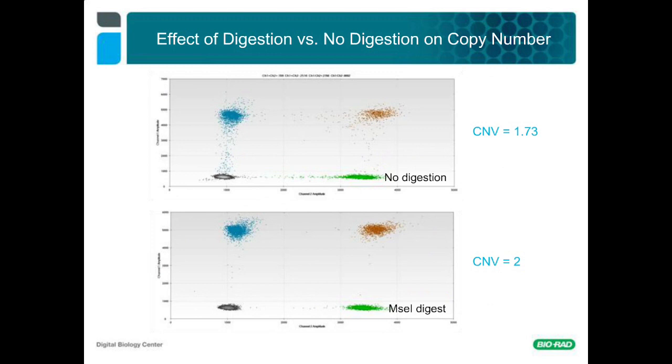If the sample DNA is fragmented and or chemically damaged, it is wise to keep the amplicon length short, as this will be able to amplify and count more of the DNA present. In the case of copy number and other ratiometric comparisons, they are also best done using matching amplicon lengths for all of the assays used.